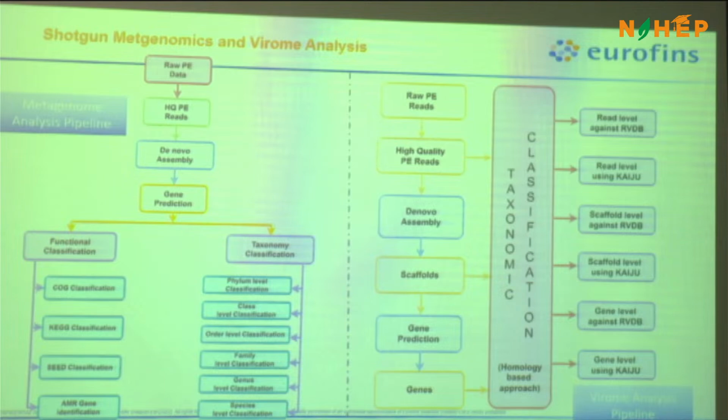So whole metagenomics. Now in whole metagenomics, as I said, we take the entire DNA and sequence the entire stuff. When we are sequencing the entire stuff, we have lots of things in the sequences. So there are different approaches to handle this. For example, we are using a plant sample. We will have a huge content of the plant, but what we want to see is the microbes which are there.